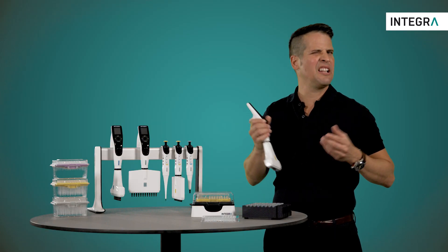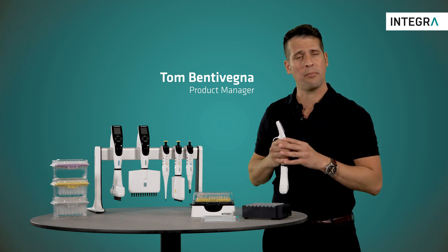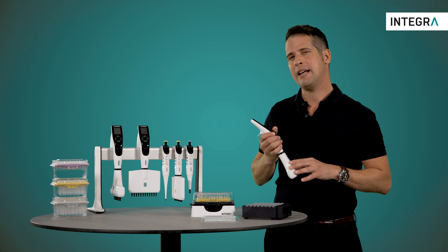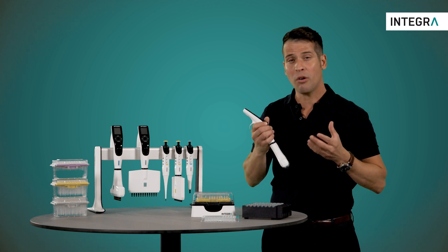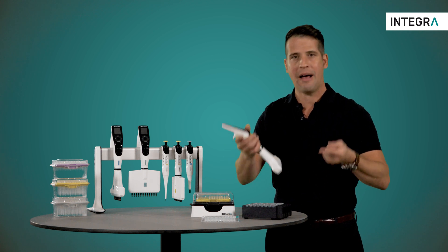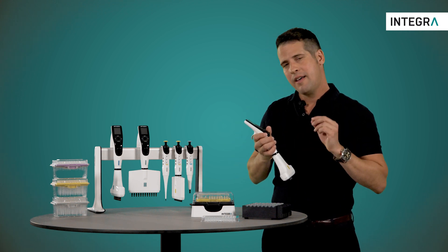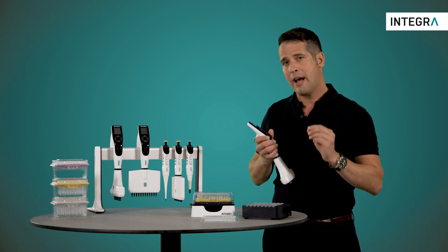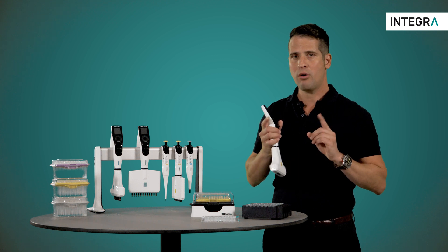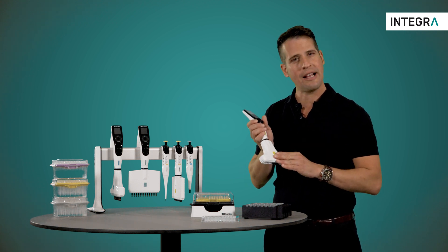Electronic pipettes are typically used to dispense liquid into plates, such as a 96-well plate or 384. However, Integra electronic pipettes also offer another mode. They can be used to aspirate liquid back from a 96-well plate or tubes, for example. This is especially useful when collecting supernatant is called for. This mode is called multi-aspirate, and I'm going to show you how it works right now.